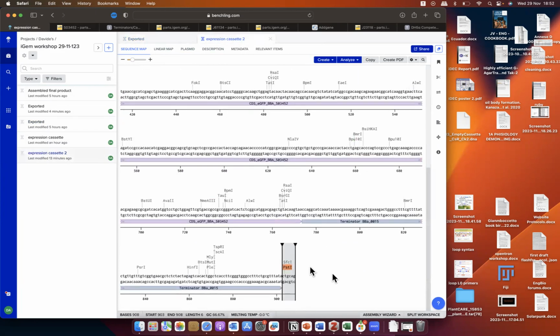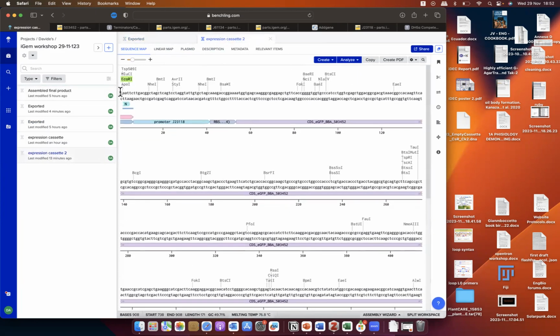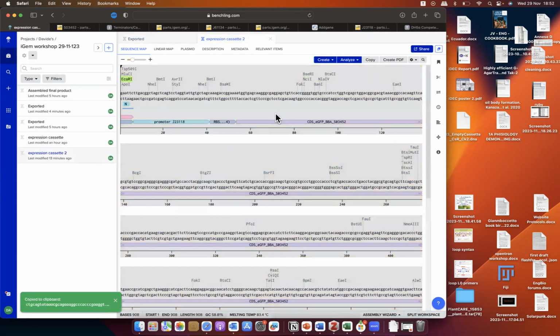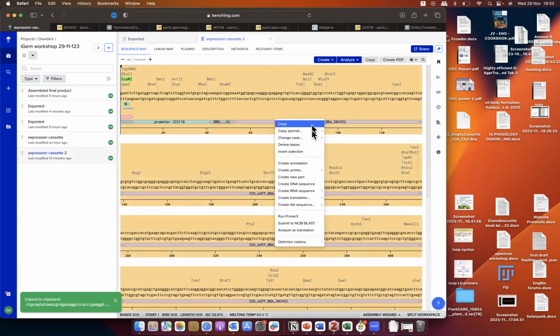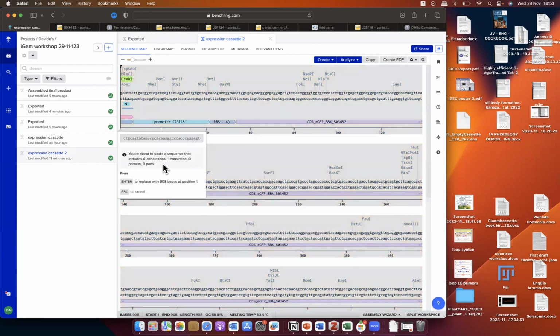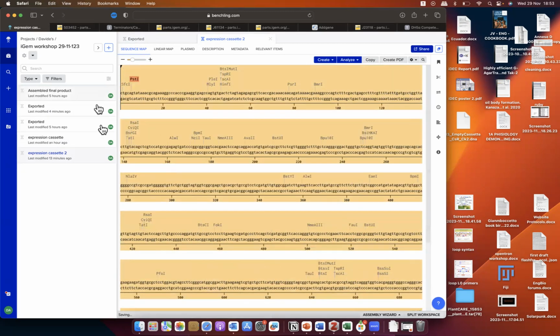What I used to do is to just copy the whole sequence and copy the reverse complement of it. So it copies the negative strand, and then I just do this way. You copy and paste in the whole sequence, and it converts it completely.